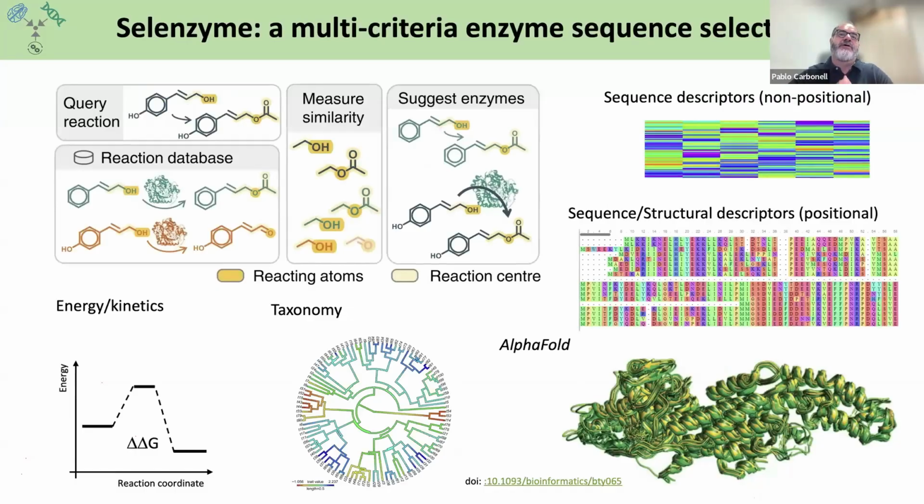And then there's another important aspect that came into this ranking function that I showed in the previous slide, that is the efficiency of the enzyme. This is one of the main bottlenecks that you will usually find in this type of pathways, because we have multiple reactions, many of them predicted, and we need to find a sequence of an enzyme that, once it is expressed in the host organism, can be as efficient as needed for our specific pathway.